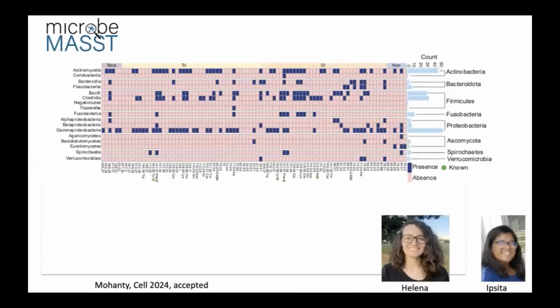We just search all 21,000 spectra. We then report on the delta masses. Some of them we have annotations for, so alanine, GABA, threonine, cysteine, for example. So for those, we have the delta masses on the bottom, and then on the left and the right, we have genera and class of organisms. And what you will see is that organisms such as gamma proteobacteria, Clostridia, bacilli, and actinomycetia are really commonly able to make many of these bile acids, which is pretty remarkable.